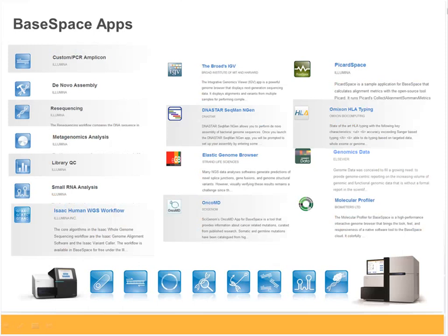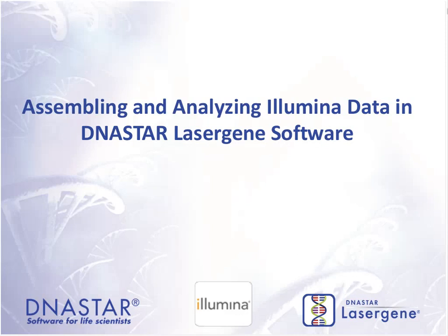So now I'd like to introduce Matthew Kaiser. Matthew Kaiser is a next generation sequencing application scientist for DNAStar, where he has spent the past 9 years helping scientists address their sequence assembly and analysis challenges. Matt supports customers in next-gen sequencing applications using DNAStar's broad software toolset, including templated and de novo assembly projects, transcriptomes, exomes, metagenomic assemblies, GWAS, RNA-seq, ChIP-seq, and similar workflows.